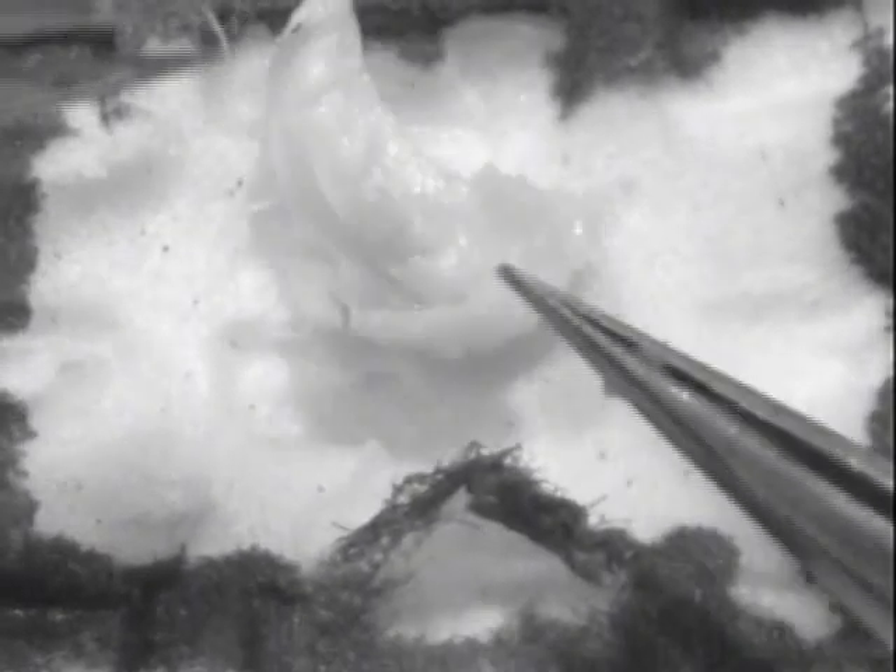The junction between the cortex and the CA1 tends to break fairly easily. I left a little bit of cortex attached to the hippocampus right here and I'm going to go ahead and cut the rest of that off. I'm just pulling it and it's coming away pretty nicely — though it broke and left a little bit more cortex there.